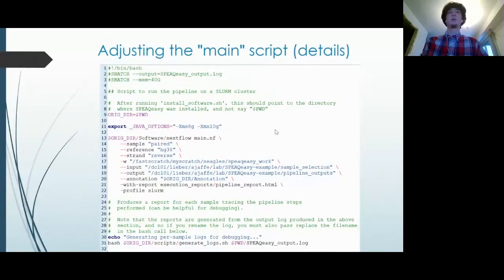So for sharing the pipeline, you would copy this main script, and based on the way this is set up, it will use the same annotation directory as in the original installation location. So if multiple users use the same annotation settings, they can benefit: if one person runs it, then it's cached for everybody else. That's the idea. So in practice, you shouldn't really have to modify this argument, but that's what it's doing.